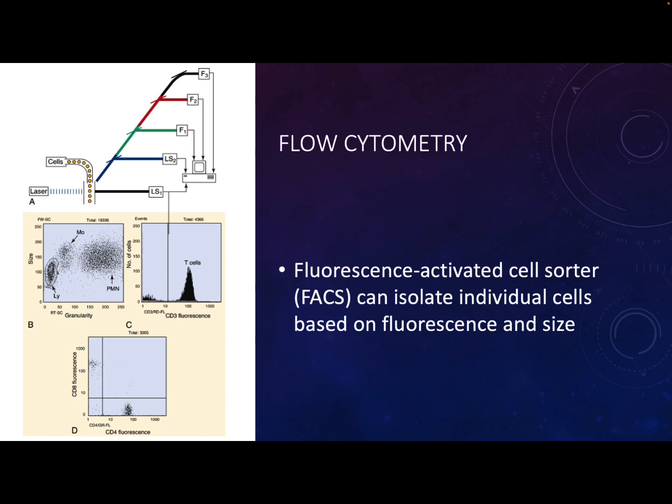Once the concentration of CD4 positive T cells dips below a certain number, combined with a couple other factors, we say that that patient has now developed AIDS instead of HIV. And so you can separate cells out based on immune markers, size, et cetera, using this machine. So this could allow you to pull out all the cells that the patient has and tell how many are CD4 positive T cells.